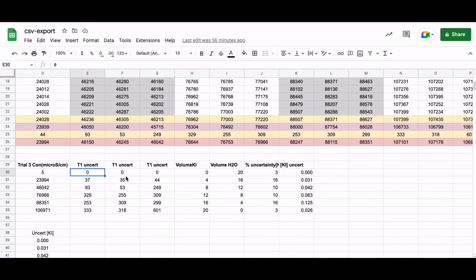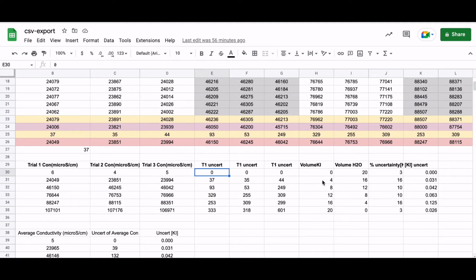Okay, so then something else that I needed to do was determine the uncertainty of the concentration of KI. And to do that, remember when you made the solution, you started by weighing the salt. So there was measurement uncertainty there, and then you made it into a solution, measurement uncertainty there, and then you did dilution, measurement uncertainty there for the first value, and then again the other value in your dilution. So for instance, for 80%, you put 16 mL of the KI solution, so that will be uncertainty of 16 mL, and then you also put 4 mL of water, so there will be uncertainty for the 4 mL of water. Okay, and then you can just add them up here.